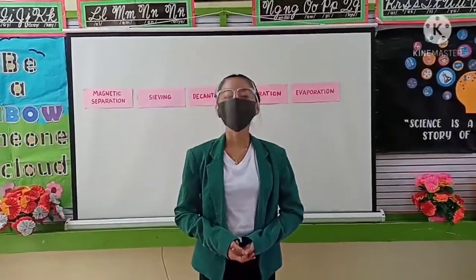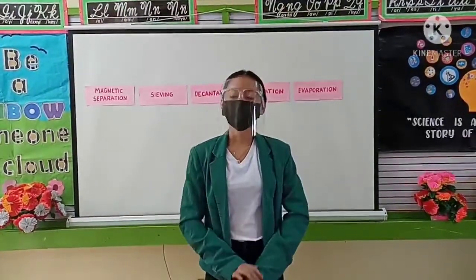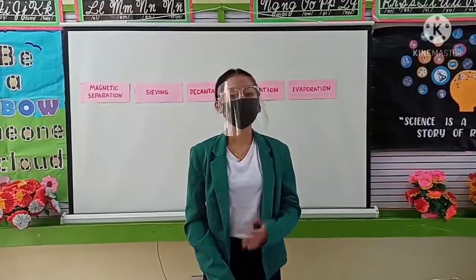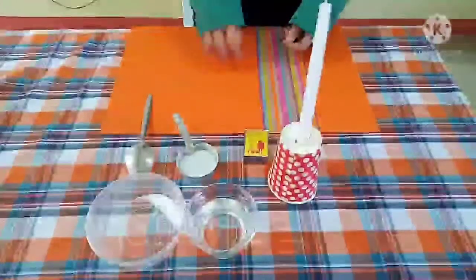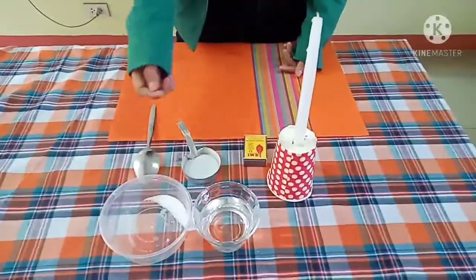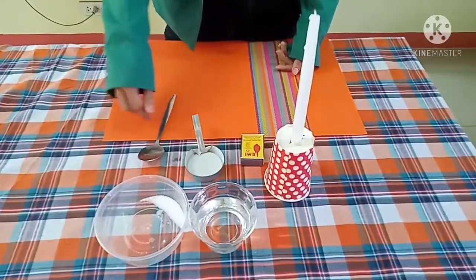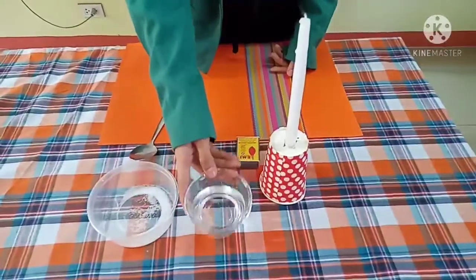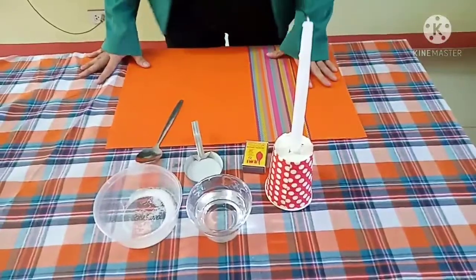So again, class, as I discussed yesterday, decantation is a technique used in separating a less dense substance from a denser one. It can be done by simply pouring or scooping the less dense substance. So another way of separating mixtures is what we call evaporation. These are the materials needed for our evaporation experiment. We have here a mini pan, a spoon, some salt, a cup of water, a candle, or you can also use a burner, and a matchstick.